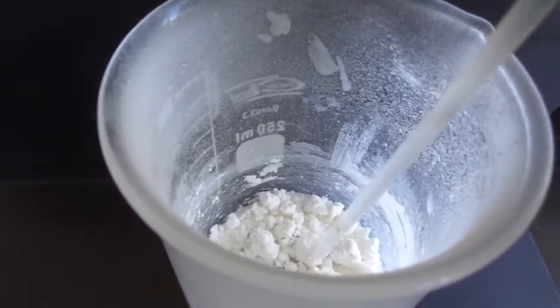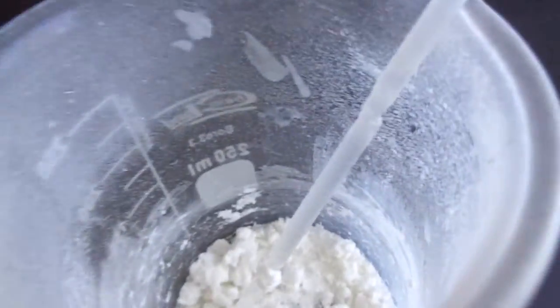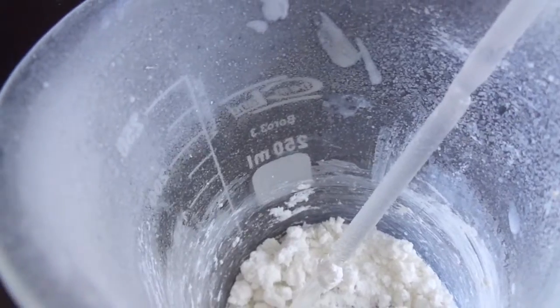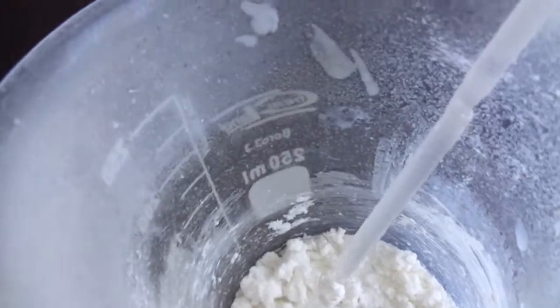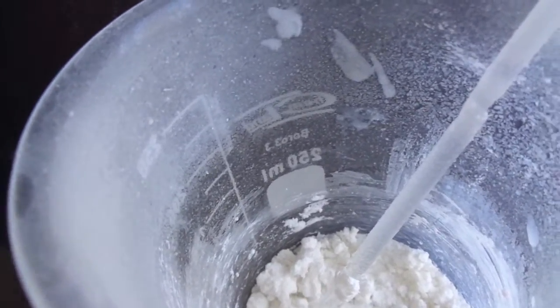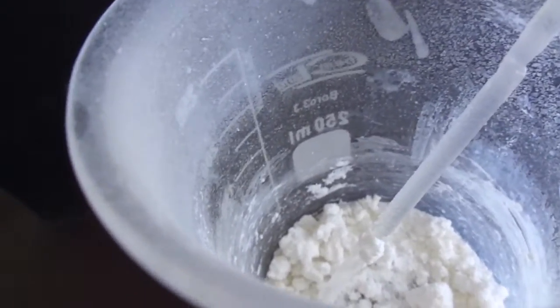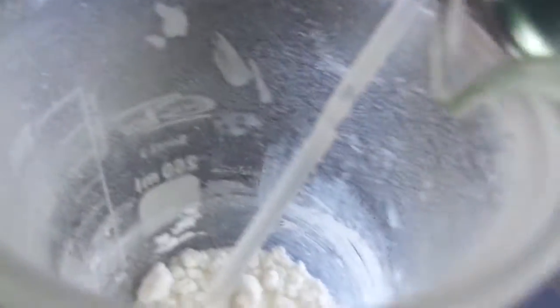I'm going to dissolve it in distilled water to remove any biuret and urea. We're going to recover the biuret, but it's not going to be the highest purity because it will still have urea and cyanuric acid in it. Cyanuric acid is pretty insoluble in water — probably about two grams per liter — while biuret is more soluble, and urea is very soluble.